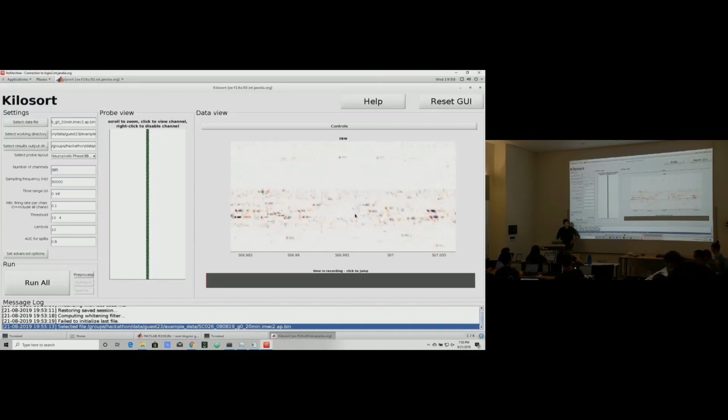Now, if the data wasn't loaded correctly, you might see something very stripy like that. So if, for example, the number of channels is off by 1, then on every row, it will just keep getting shifted one further, and it's going to have a stripy artifactual pattern. But it's not, right? So maybe we zoom in even more here.